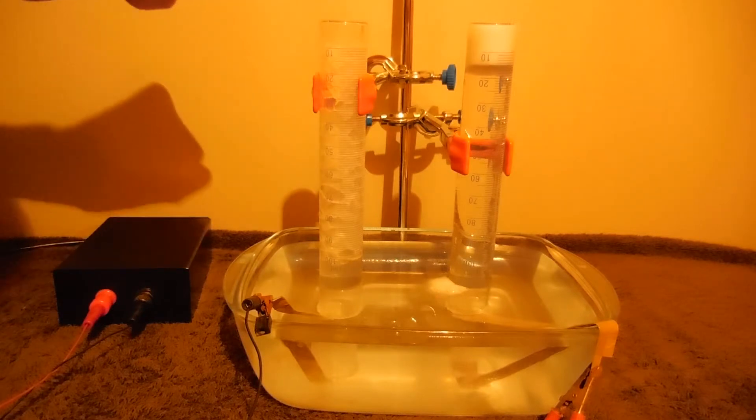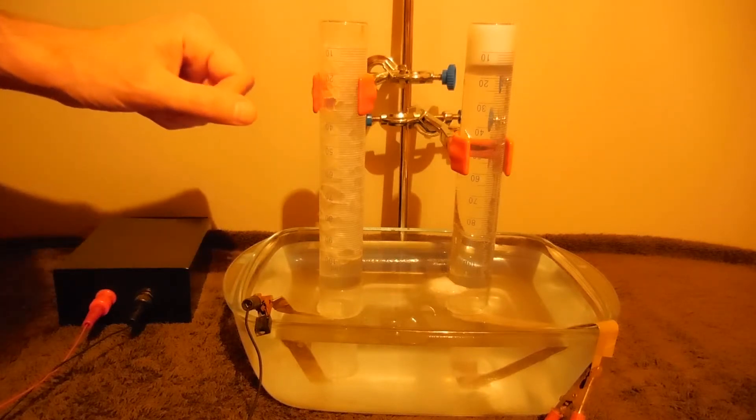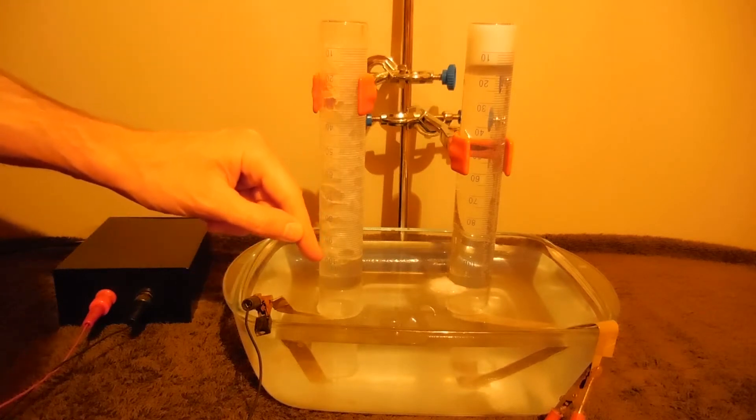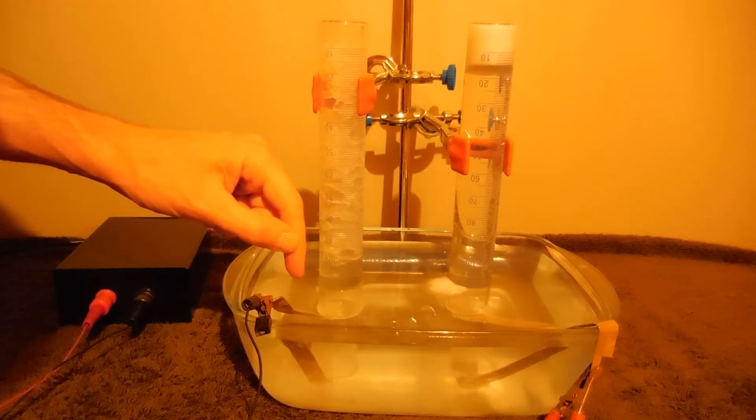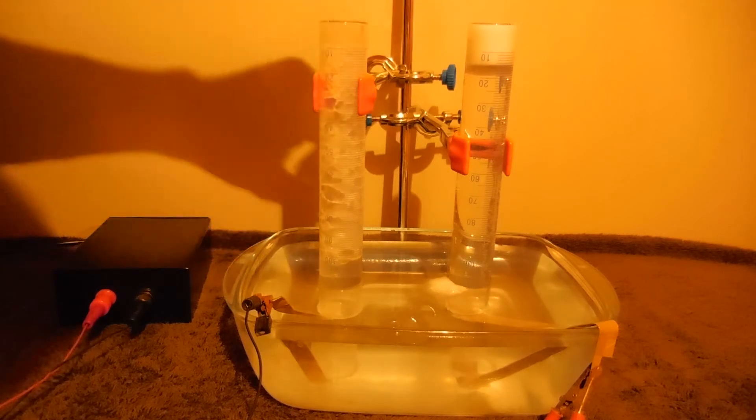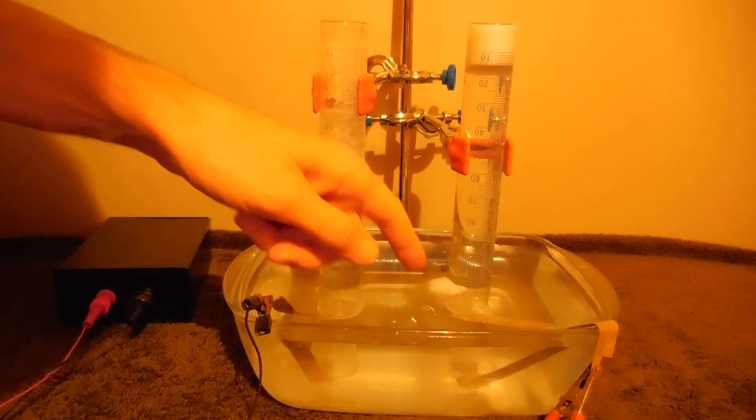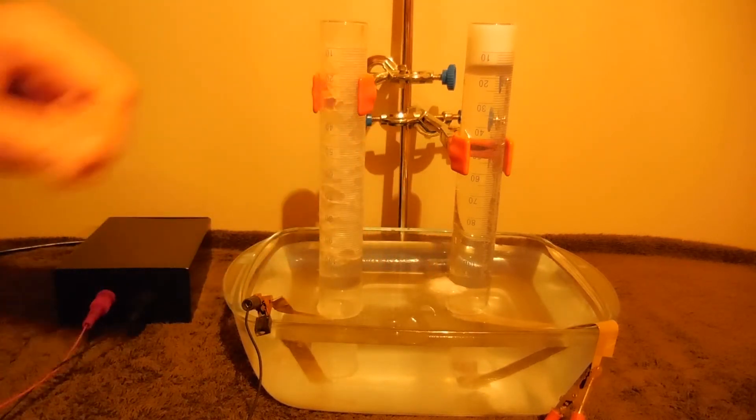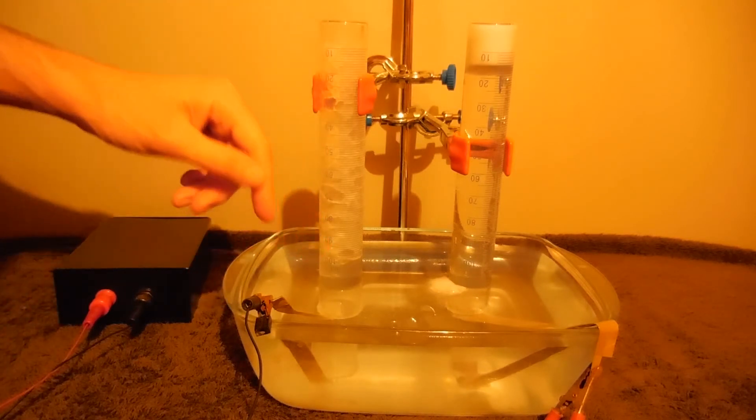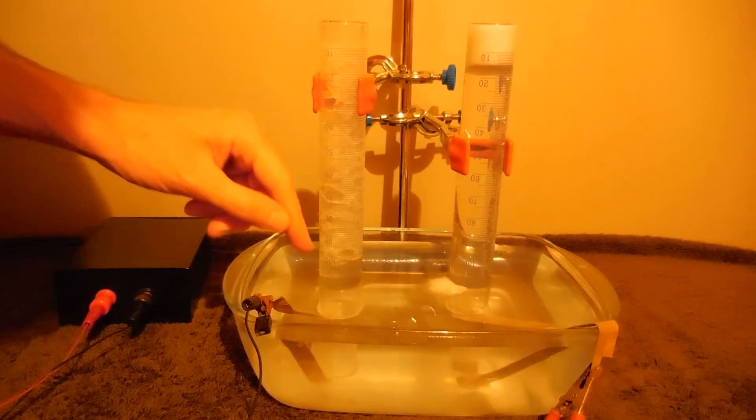After 93 minutes, as you can see, 100 milliliters of hydrogen has been produced at the negative electrode and 13-14 milliliters of oxygen from the positive electrode. There is a large amount of foam which is making reading harder.